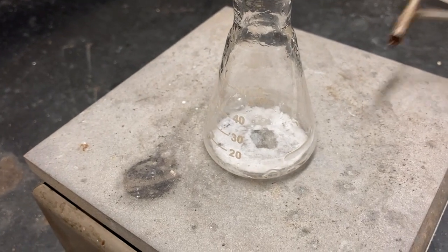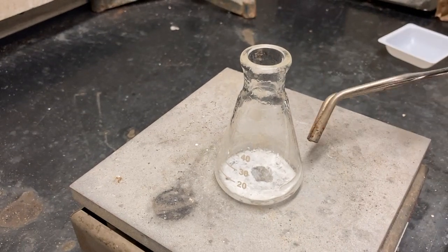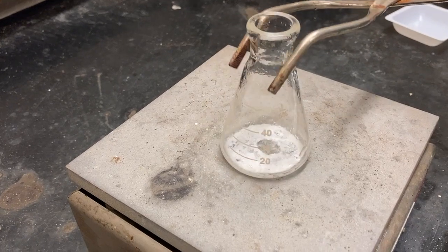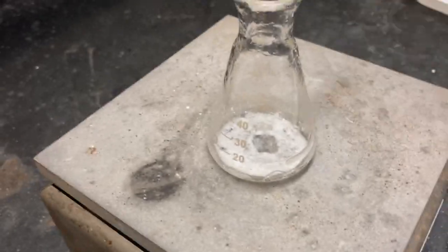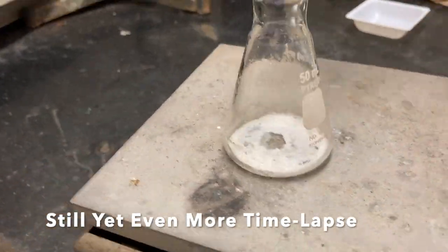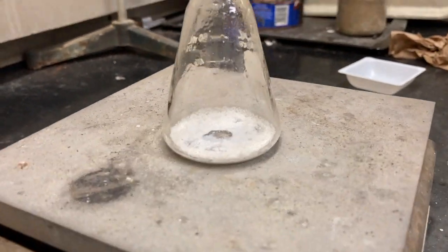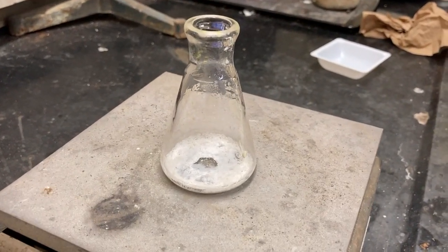What we're going to want to do is gently hold this over a burner, and that's going to evaporate the rest of the liquid on the walls here that's hard to evaporate because it's not as close to the heat source. You said that we would take this over to a Bunsen burner to dry off the sides.